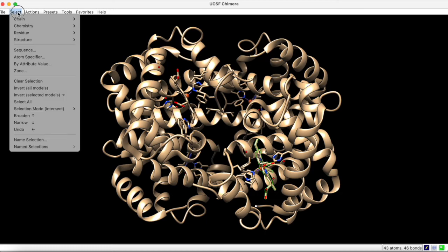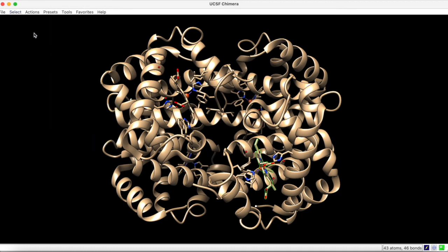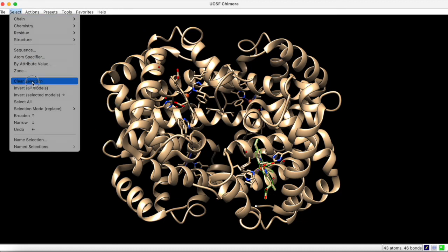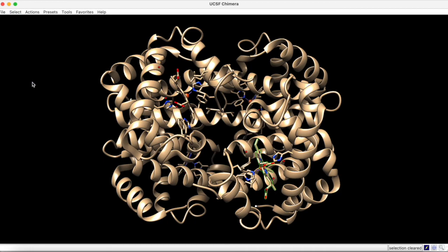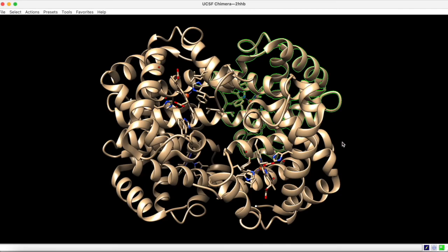Remember to reset the selection mode back to replace, and clear the selection before proceeding further. Once you have made a selection in Chimera, you can perform actions upon that selection. Here, we have selected chain A.